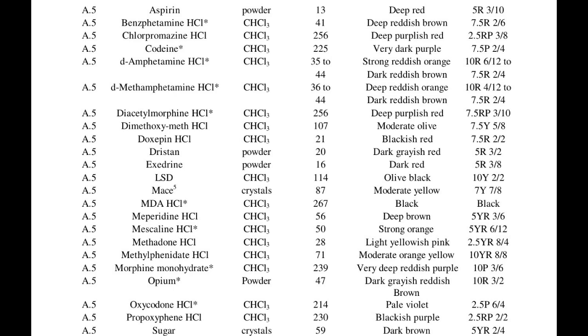One nice thing about these general tests is that they're usually pretty easy and cheap to make, so you can do more than one on a sample. Like I've said before, if 2 or 3 reagents give the right result for a compound, then you can be a lot more certain that you do indeed have what you think you have. I know, not always practical, but nevertheless, it is true.